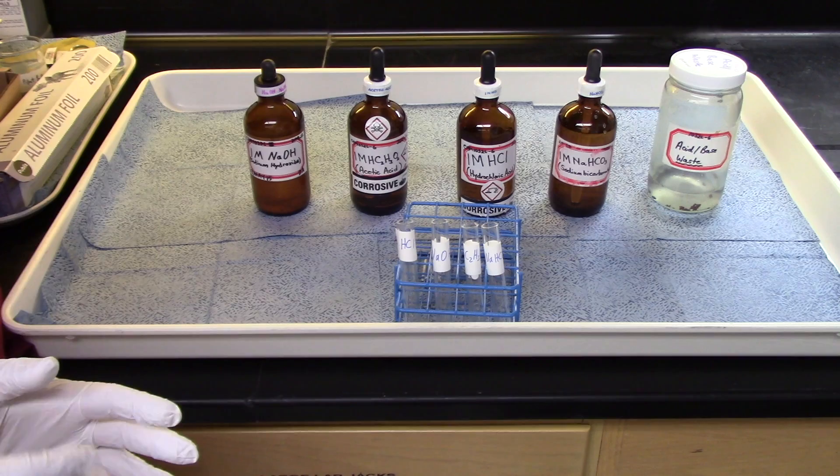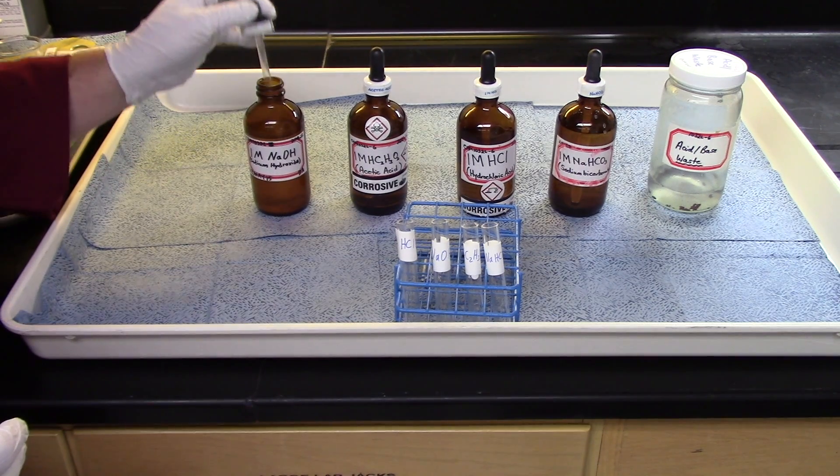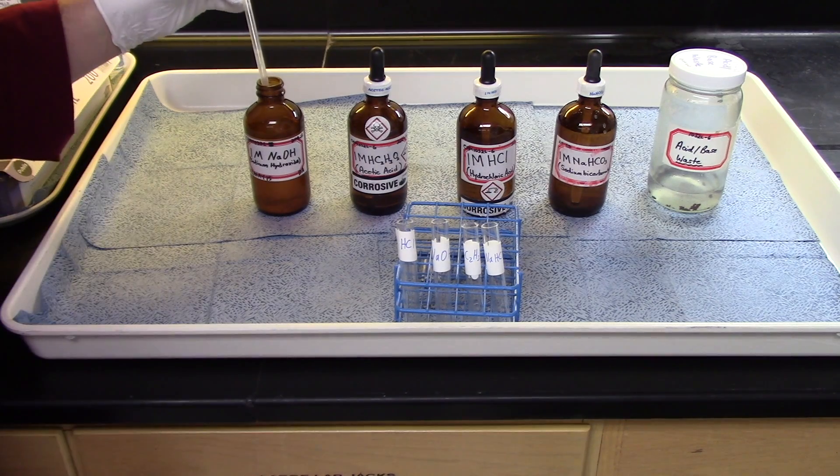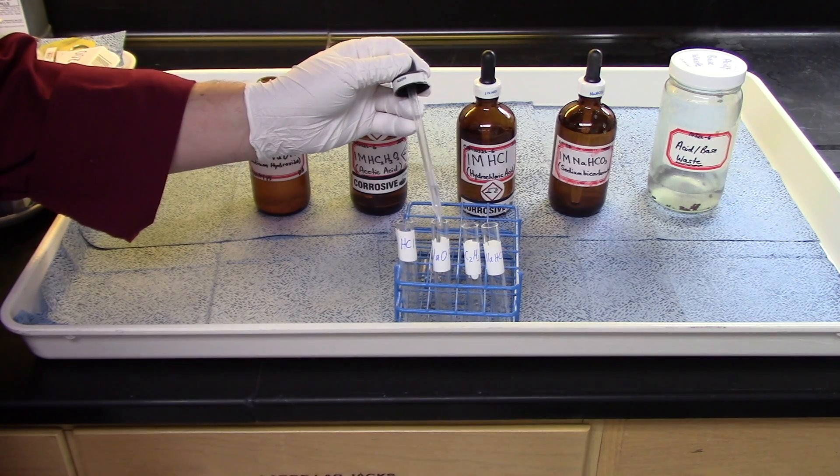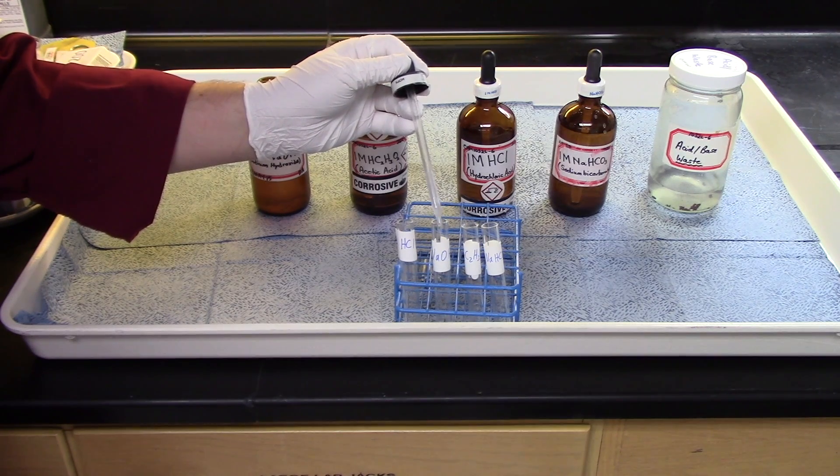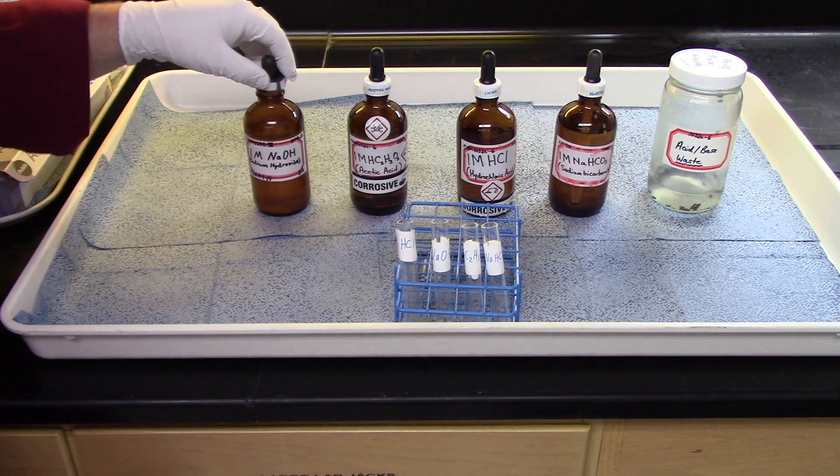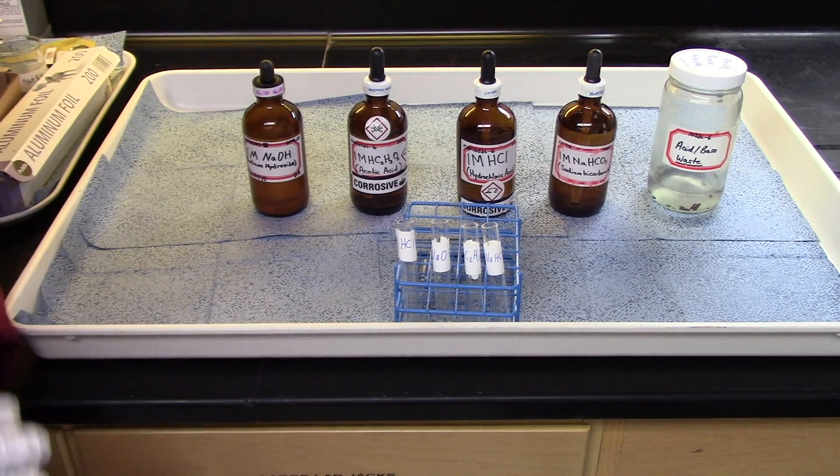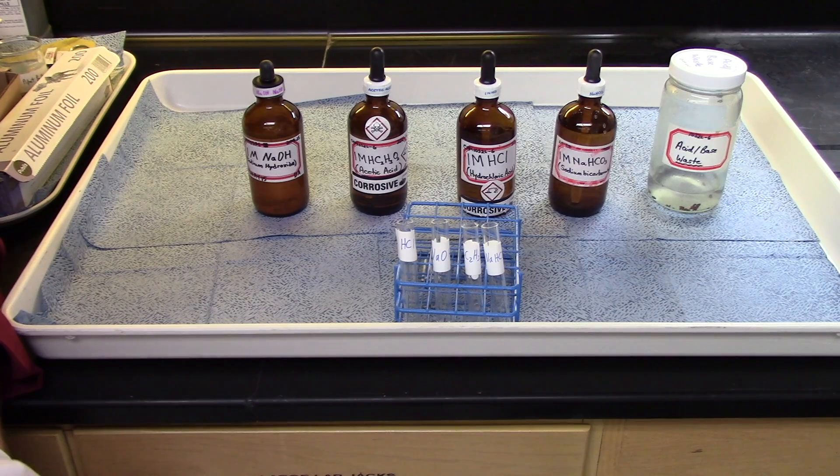Same as before, just take one of the dropper bottles and drop about ten drops into the test tube that's labeled, for example, NaOH, which is right here. One, two, three, four, five, six, seven, eight, nine, ten. One for good measure. It doesn't matter if you have ten, eleven, even nine. That's not really critical. As long as you have, you know, somewhere around ten, it'll be fine. Do that for all the reagents, and then take them back to your bench for experimentation.